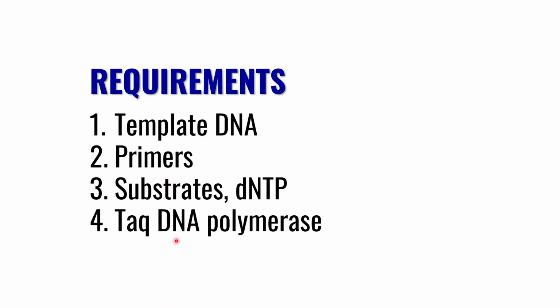So the following are the components or the requirements of PCR. Number one is template DNA, primers, substrates or dNTP, and Taq DNA polymerase. I will elaborate on each of these components in the next slides.